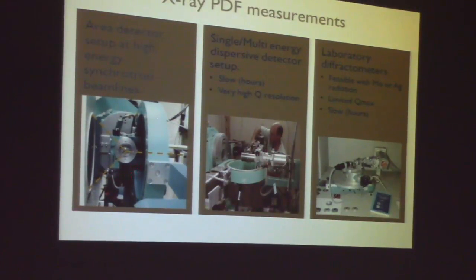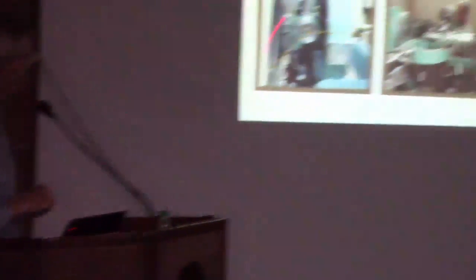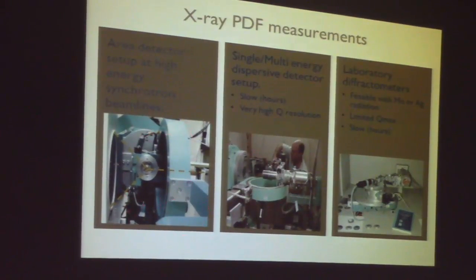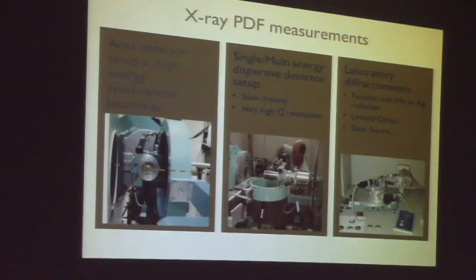Many beamlines have a mail-in program where you send your sample by mail, and they'll measure the data and then send the sample back and send you the data. So just because you don't have a synchrotron here in India, don't believe that you can't do it this way. We also have very good access to the Brookhaven synchrotron, so we can help you. If you send samples to us, we can often measure and send the data back to you. To access that mode, you should just email me.